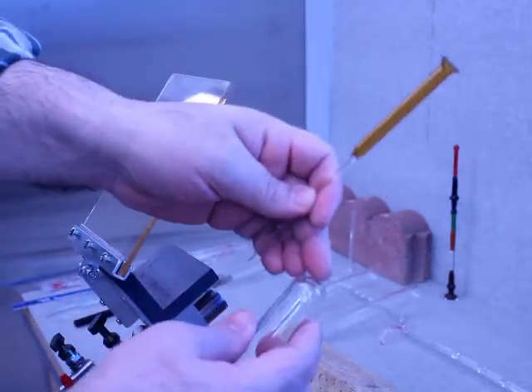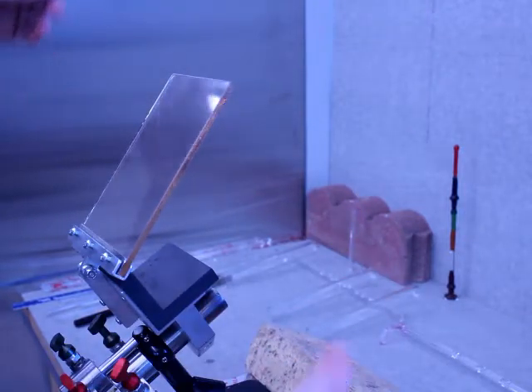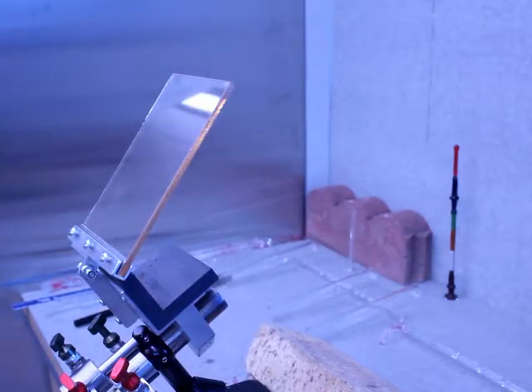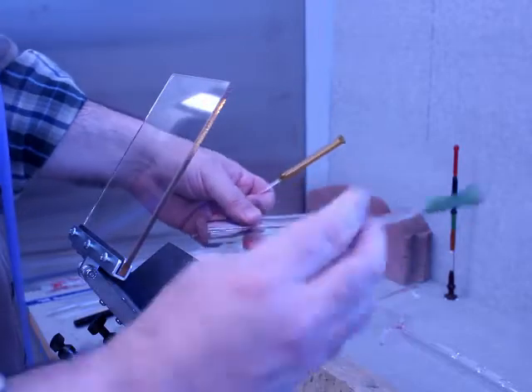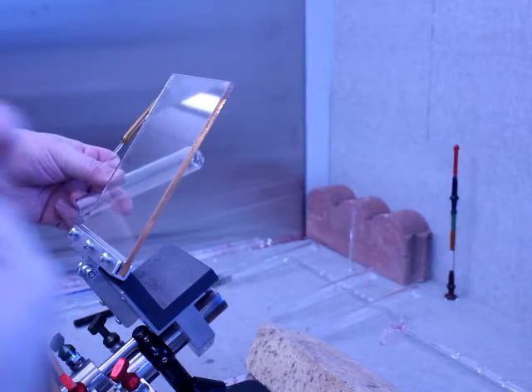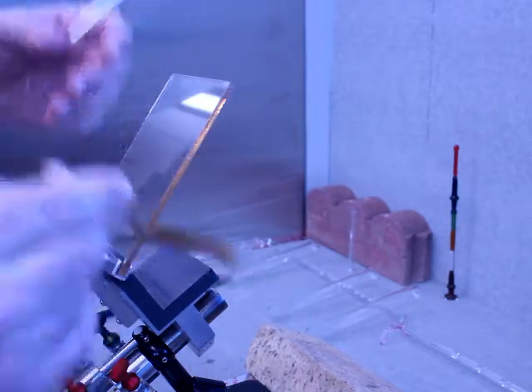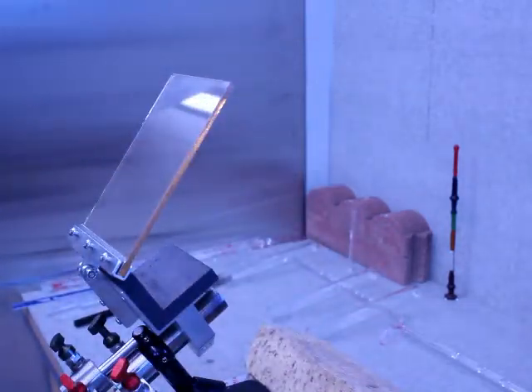The first thing I have to do is heat up right here, pop a hole, fuse these two together, making a straight seal, or what's called a butt seal, and then I'll have the inlet for my bubbler. The next step will be to put the outlet, and I'm also going to use colored glass for that. I'm going to have all of these videos edited together rather than do it all in one go, just because of the positioning of the camera and all that goes with it. So let me get started.